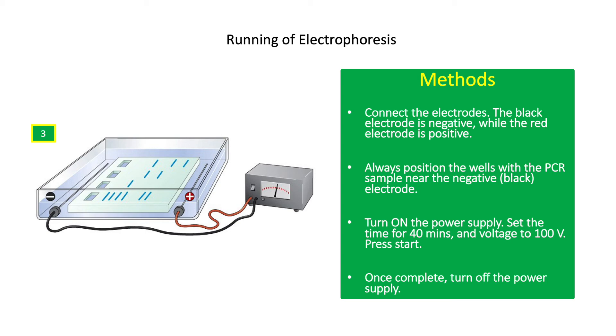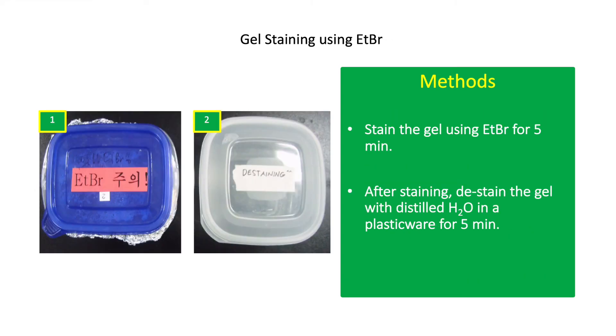Do not allow the dye front to move out of the gel. Once complete, turn off the power supply. Carefully transfer the gel into a plastic container and submerge the gel in 100 ml of 1X TAE buffer. Add 5 to 10 microliters of ETBR stain and label the container properly. ETBR is mutagenic and should be disposed of properly in waste jars after use. Wear fresh gloves and lab gown when handling ETBR. After staining, destain the gel with distilled water in a plastic container for 5 minutes.